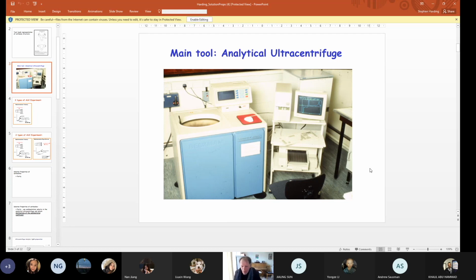Okay, first of all, it's an instrument, it's not a machine. A machine is like a tool which you press buttons and it does operations and that's it. Whereas a scientific instrument is one that you have to interact with to get the required measurement.